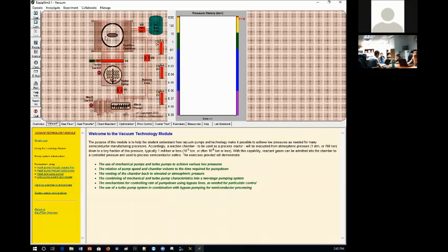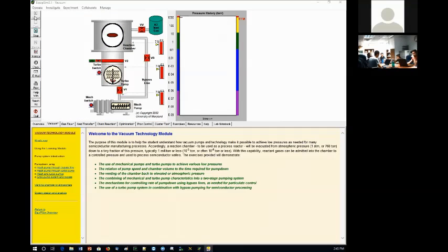All right. Okay, now we will go to the left corner and say start. Okay, so that's the thing that we're going to hit. And it should make this portion white out. A couple of things to remind you. Now, this side here is the pressure history. As the name says, this is just a gauge showing you the pressure as time is going on, okay?